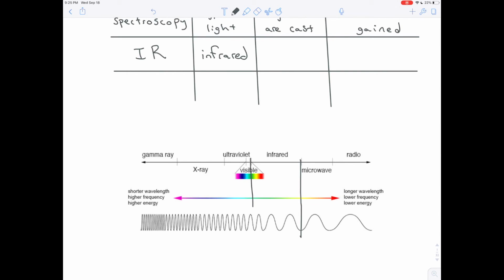Different types of those waves are separated, categorized, based on how frequently the waves hit you. Because the more frequently waves hit you, the more energy they carry. Just like if you stand in the ocean, water's hitting you one wave after another, it's carrying a lot of energy. So likewise with these light waves. They classify these waves based on how much energy they have, because the amount of energy they have determines what they can get done.